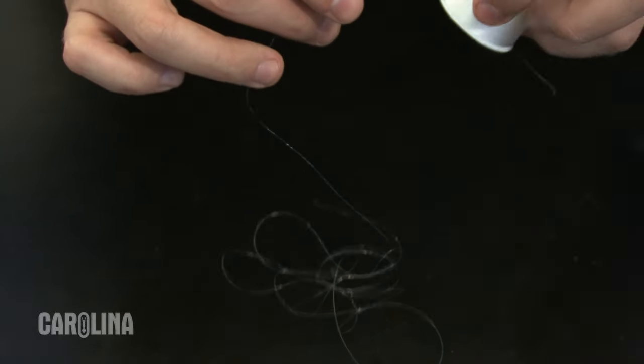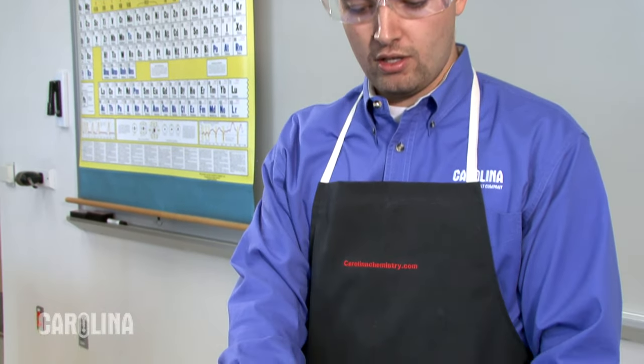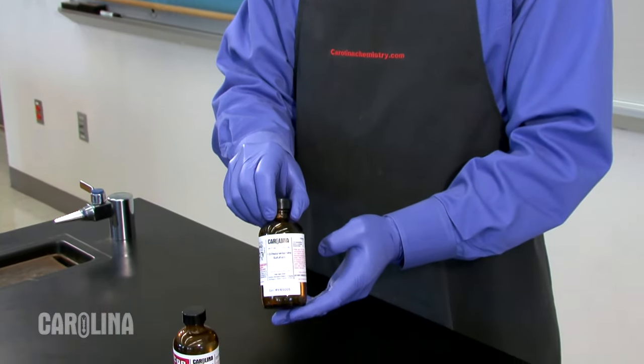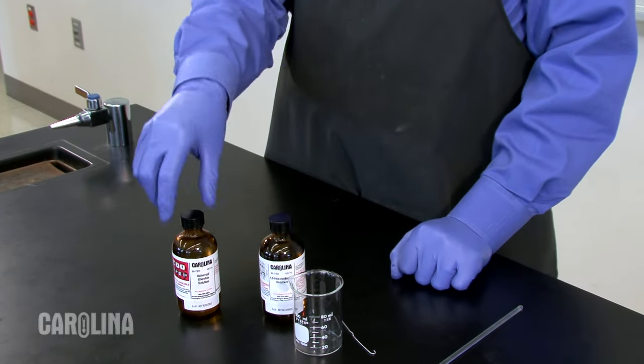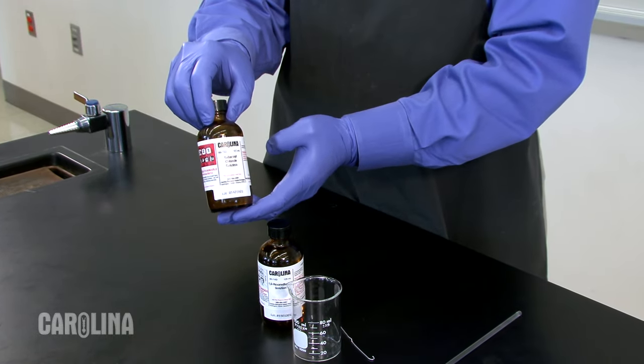Another very common polymer is nylon. In this experiment, we'll combine our diamine, 1,6-hexanediamine, with sebacoyl chloride, a substituted dicarboxylic acid.